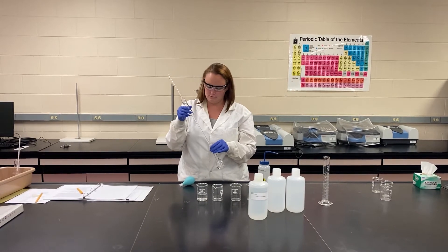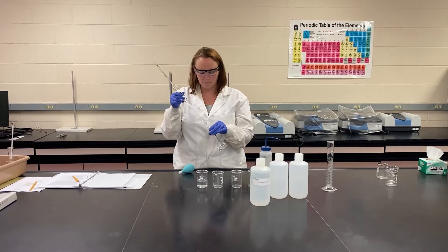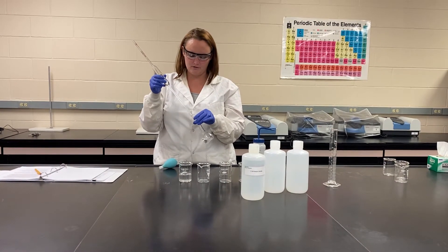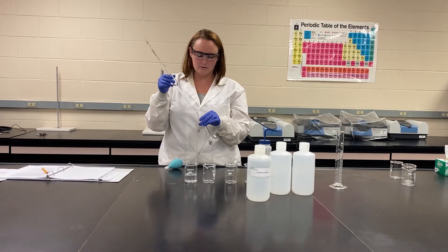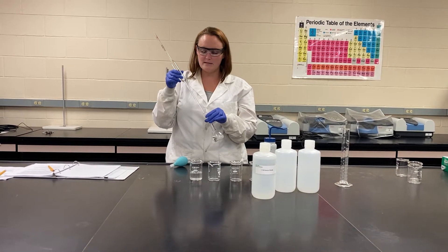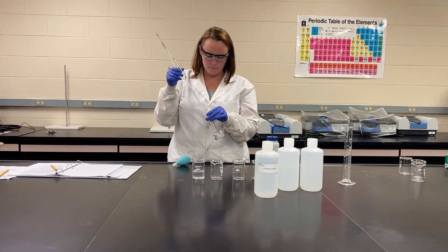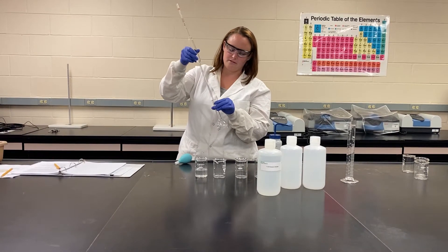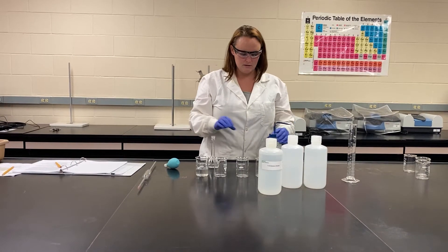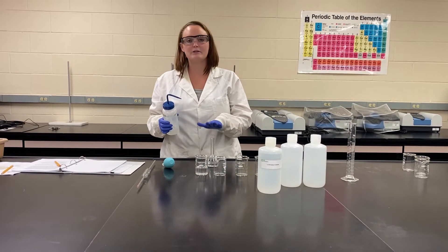Make sure to release all of it into the volumetric flask — that is a time-consuming thing. Once it is all released into the volumetric flask, you are going to fill the rest of the way to the line with DI water. This is called a dilution. You always add your stock solution first before adding your water, because the water is what's going to create the rest of your volume that you need. So we've added our 50 mLs of stock solution; now we're going to add roughly 50 mLs of water, but we just want to add it to the line.